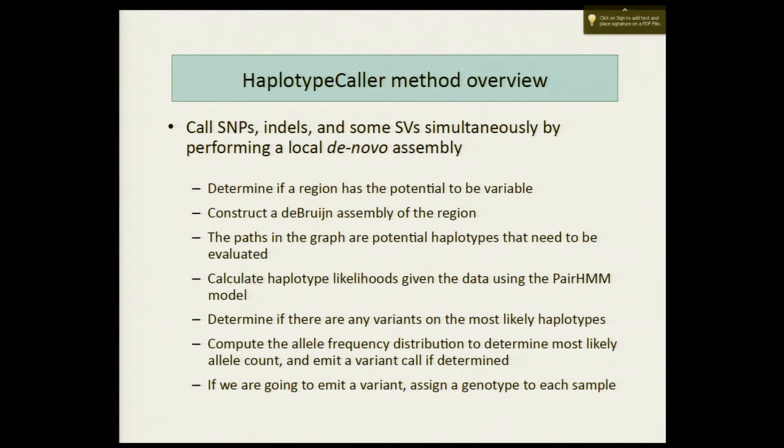So the way it comes up with possible alleles is by building this assembly graph, which is very different than just coming to the reads and trusting their alignment and asking what's the universe of possible alleles using just those reads. Does everyone see the contrast between that? So is it a bit like what Indel realigner does, and that kind of shifts everything?